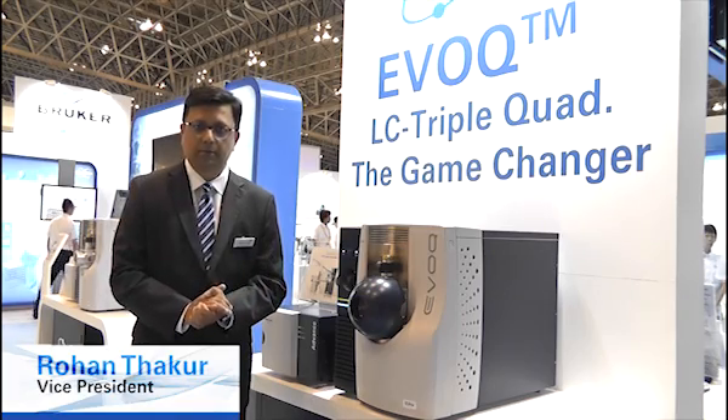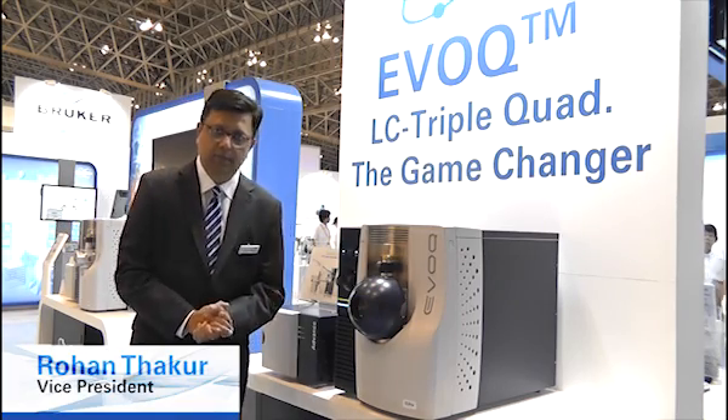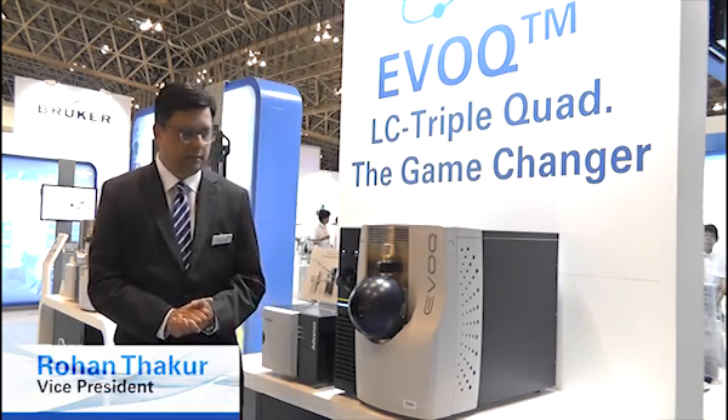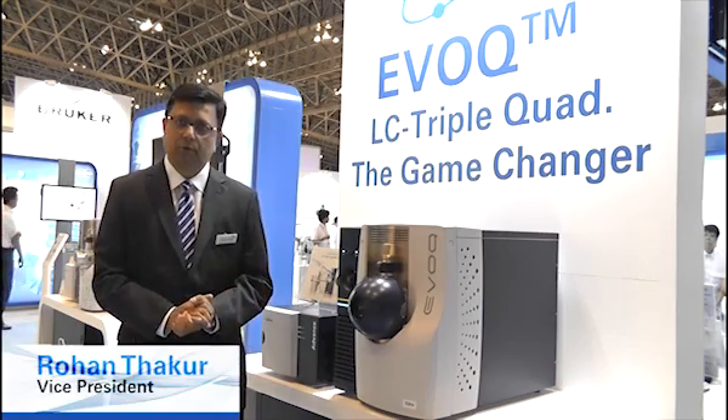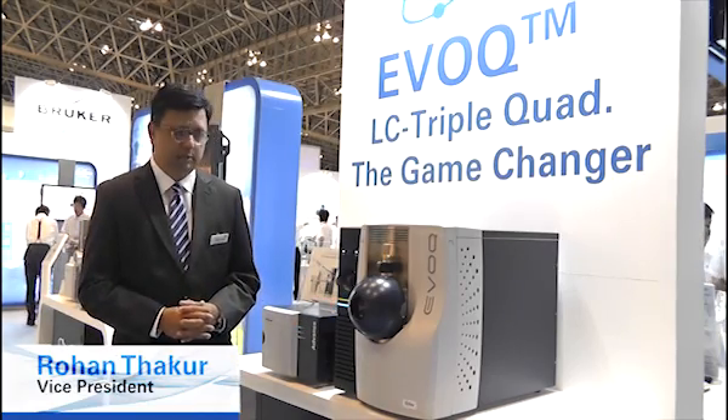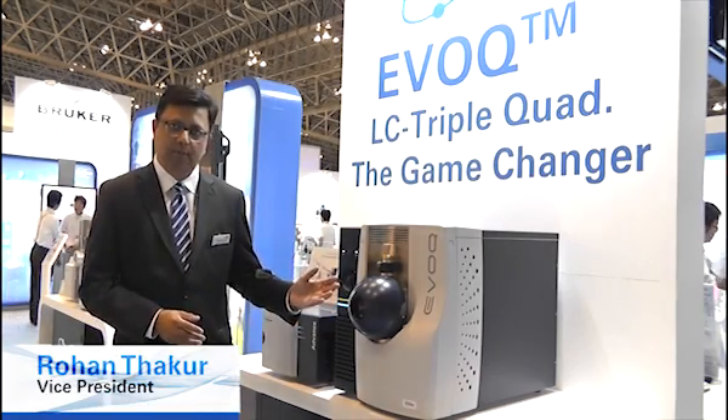You can learn more about this on our website, which is www.evoqms.com, where you can download the brochure, application notes, and take a look at the inner workings of the innovation that's represented by the Evoq LC-MS.